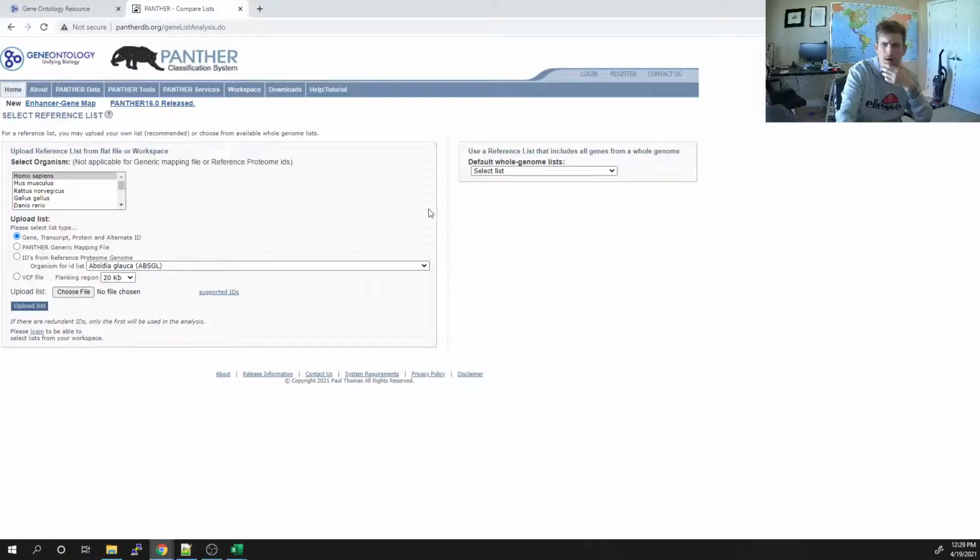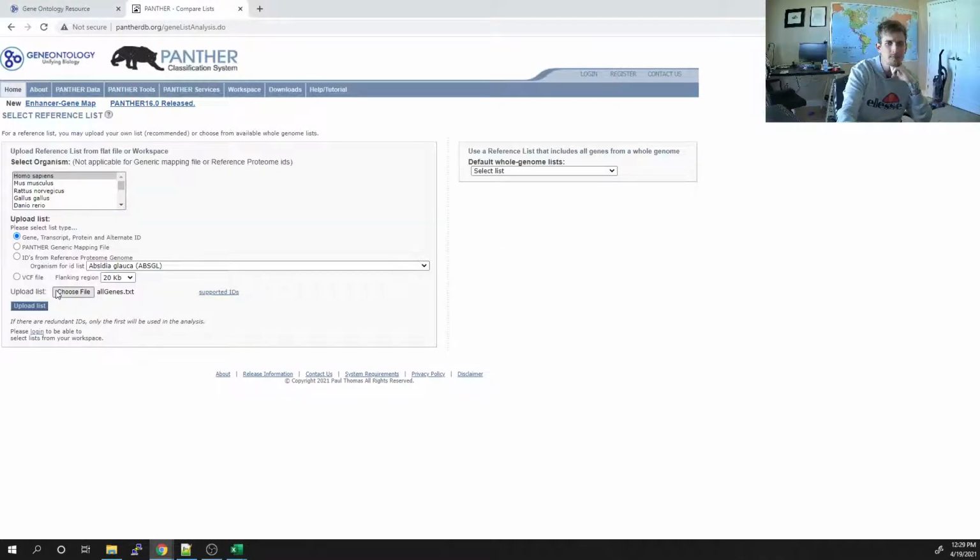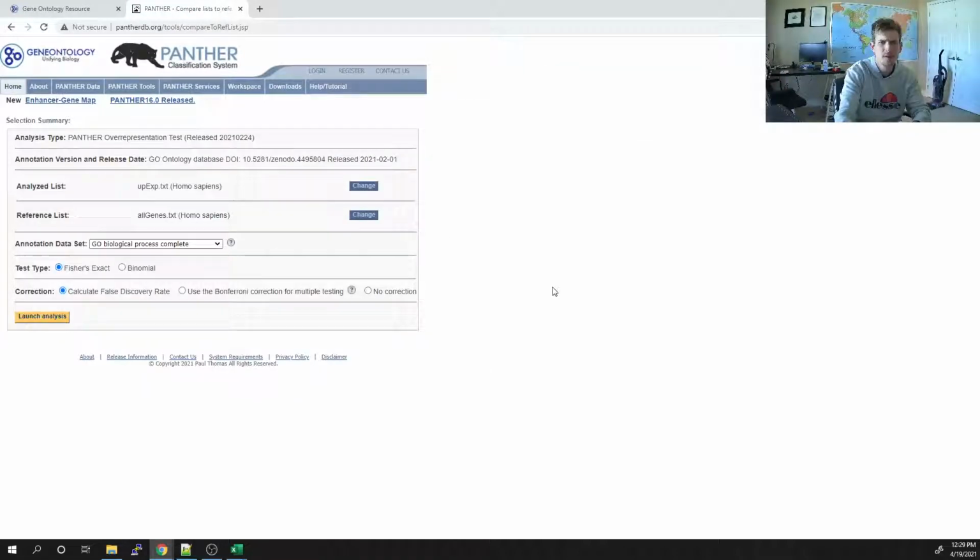Right. So, no, I still need to add my all genes. Okay, up expressed, all expressed, and biological process. Okay, see if anything pops out.